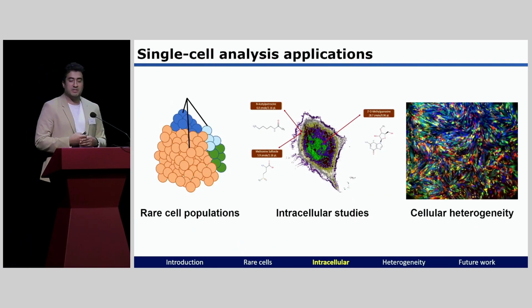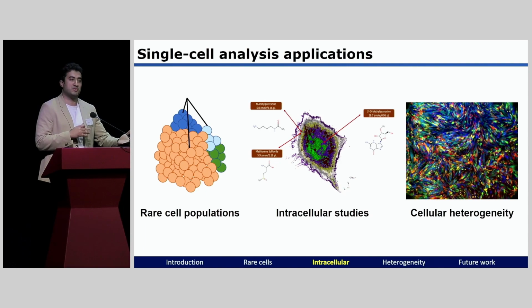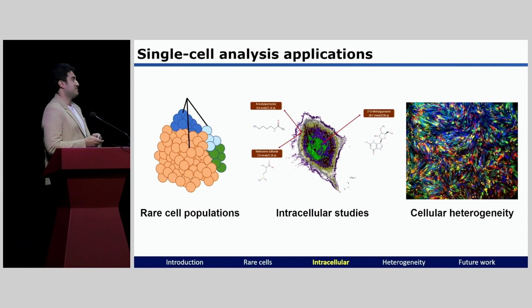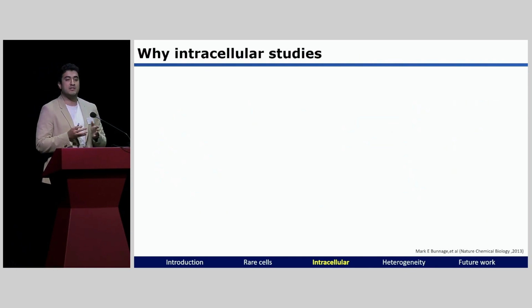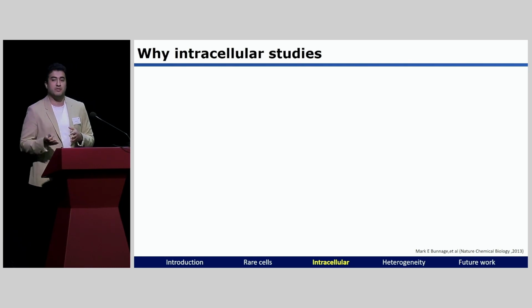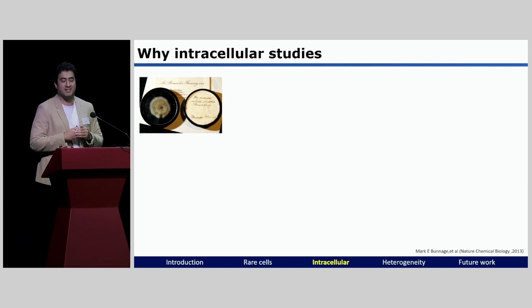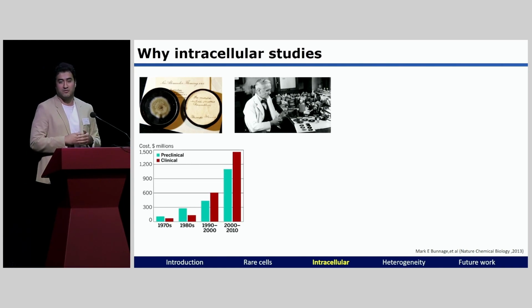Now, switching gears a little bit, if we're talking about intracellular studies, one might ask, why bother? I mean, it's already difficult to do single-cell analysis by itself, and now you're asking me to measure things inside the cell, which is, of course, very hard. The reason why it's important is mainly due, I think, to drug discovery efforts. The days where I'm a lazy scientist, I went on holiday, found some interesting mold, discovered a drug and got rich and famous are long behind us, sadly. Now, to develop a drug, it costs billions of euros.